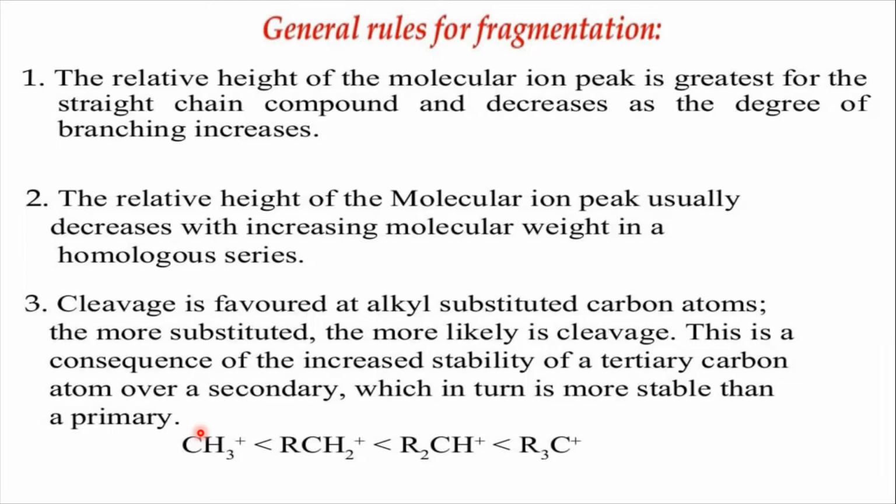Now I have explained that the cleavage occurs at the branching point, or at an alkyl substituted carbon. Whenever the cleavage occurs at an alkyl substituted carbon atom, a carbocation is formed which is more stable. If we consider the stability of the carbocations, the tertiary carbocation is more stable than secondary, than primary, than the methyl carbocation.